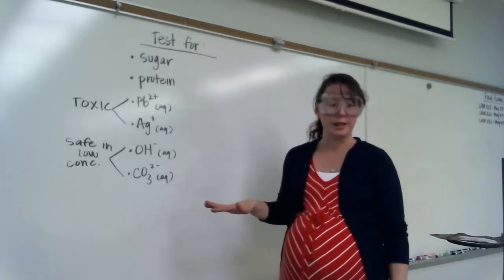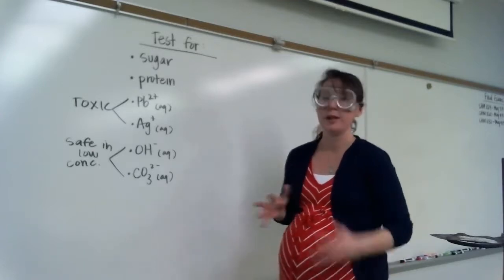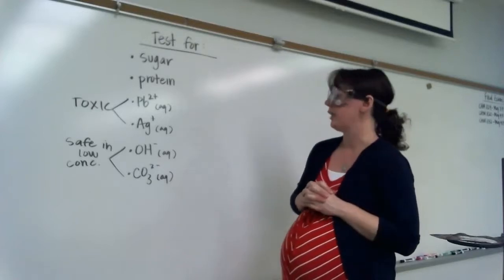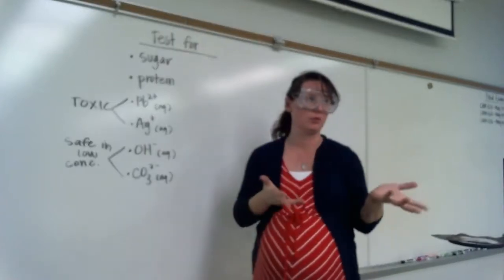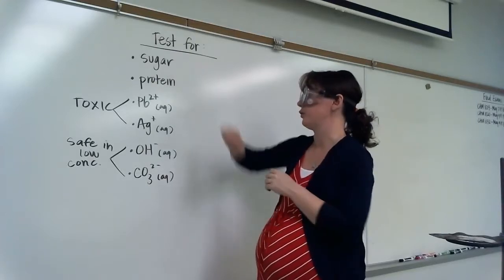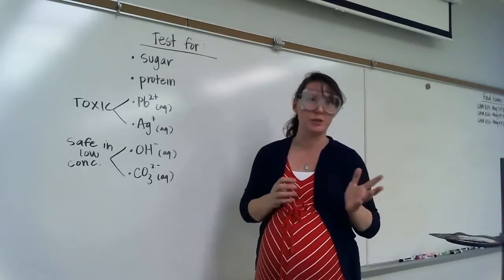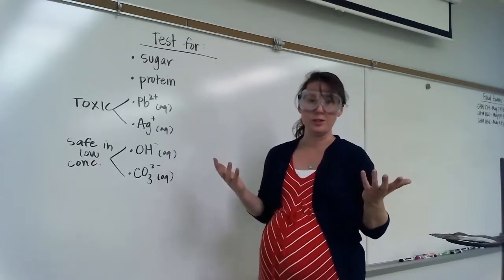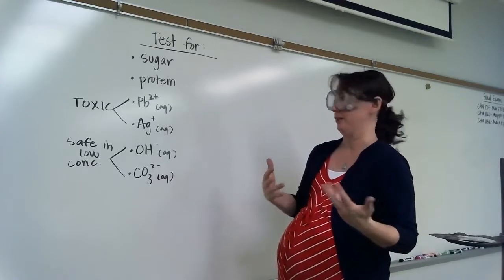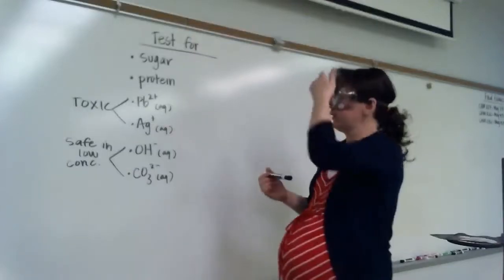So what we're going to do today is some simple water quality testing. I'm going to pause the recording so that you can make your predictions at home or in your classroom, and then I will show you what we're getting as our results. So let's first test for sugar. Hit pause, talk to your friends, the person next to you, or if you're watching this at home, pause and think about whether or not you think this is going to be positive. And then once you've made a prediction, hit resume.